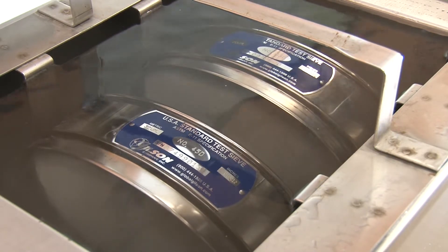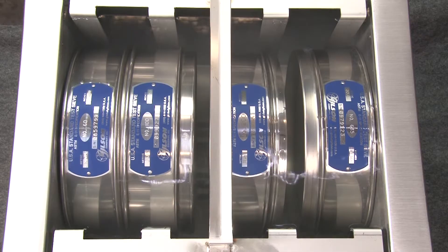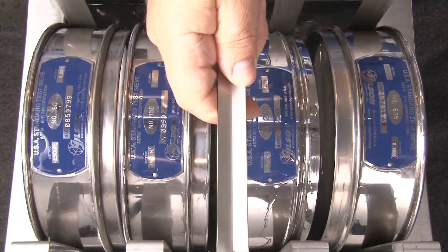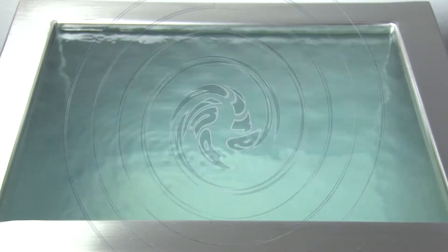It's important to know where the transducers are mounted within the cleaning tank's wall. Surfaces closest to the transducers receive the most aggressive cleaning action. Therefore, the sieves should be positioned with the most contaminated mesh closest to the transducers. The cleaning action is multi-directional, so the whole mesh — sides, tops, and bottoms — are gently scrubbed.